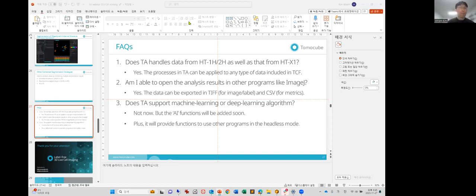So there are two ways to get that kind of segmentation. Actually, it's not that difficult. If you ask us, we can support it. At the moment, we are very open to supporting your requirements because we are at the phase of developing pipelines. And I think it's very straightforward. If the membrane is fluorescence tagged, we can fill those regions. One way is to fill the regions based on the perimeter segmentation, like fill hole.